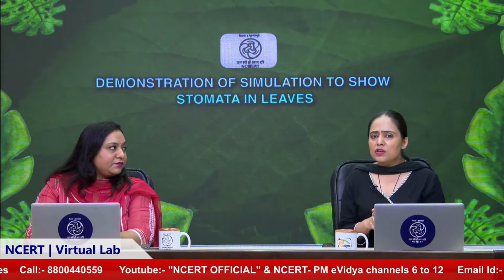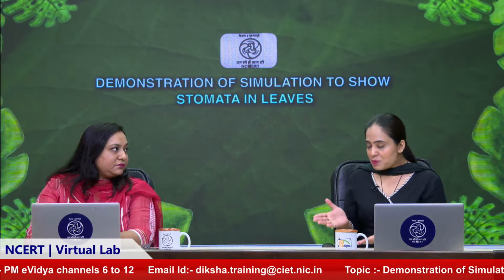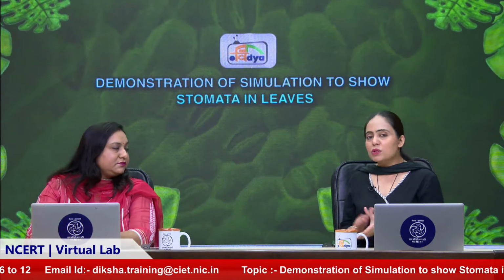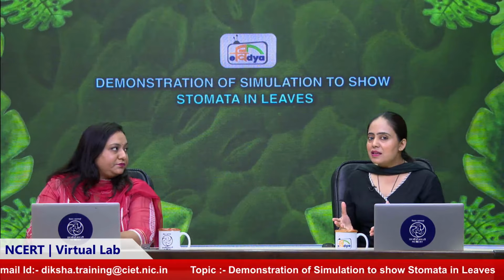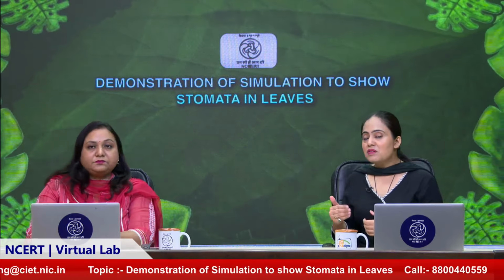Ma'am, we have been telling our viewers about virtual labs, and by now they know that a virtual lab is a free of cost tool which is extremely accessible and helps us perform simulations and understand the concepts. But when it comes to certain concepts that are generally performed in real surroundings or physical laboratories, is that a challenge? Because the experiment that we are going to learn today is stomata. First of all, we need to understand what exactly stomata is and what are its functions. So tell us, what exactly does stomata do in a leaf, and can we understand this entire experience through virtual lab?